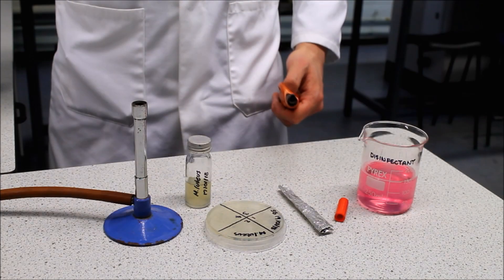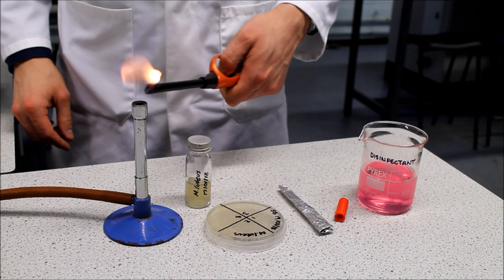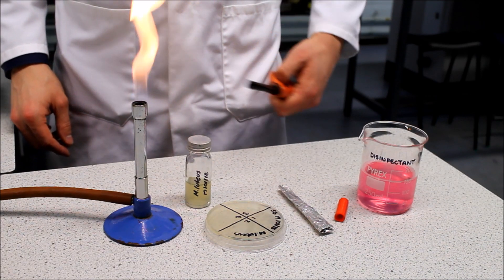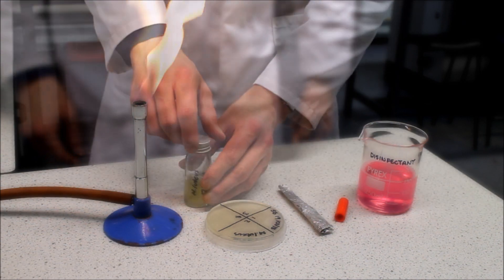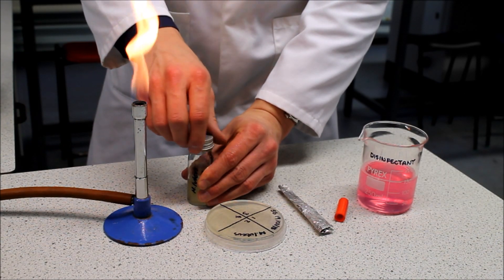Light the Bunsen burner and work close to it from now on as the hot air currents carry microorganisms up and away from the plate. Loosen the lid on the bacterial culture but do not open it yet.